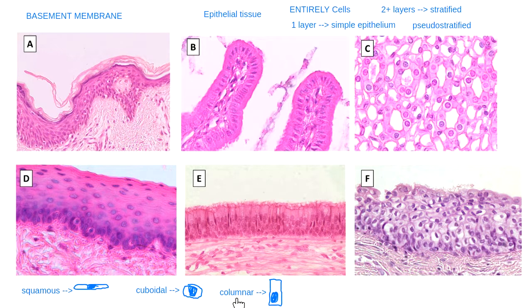In the chat, can you tell me what letter or letters represents columnar epithelium? Yeah, so a few of us are chiming in. We are definitely agreeing here on B being a type of columnar epithelium. Columnar epithelium, remember, is not nearly as wide as it is tall. So this is definitely columnar epithelium. If you see these dark spots, this is the nucleus of the cell. I have one line of nuclei, so one row of cells that I see right here.